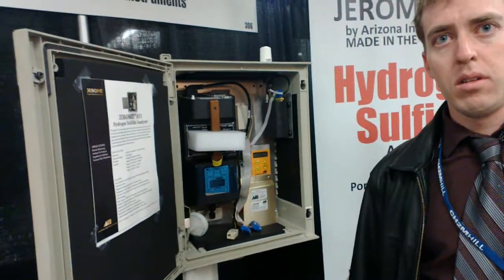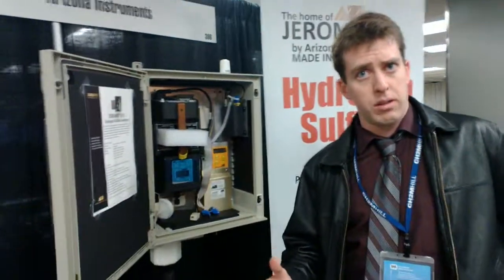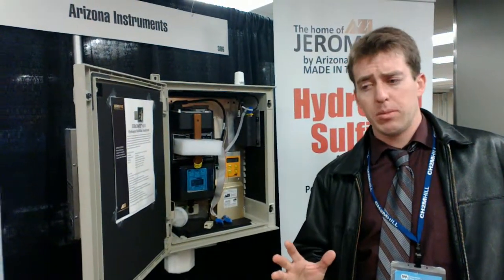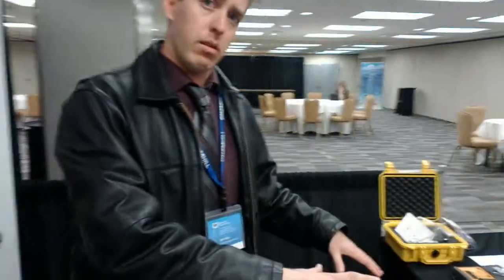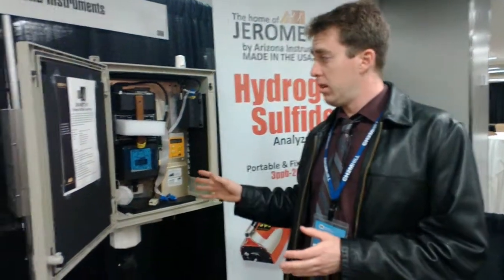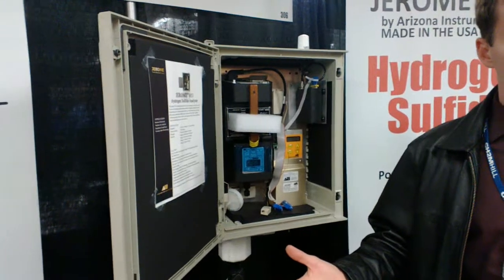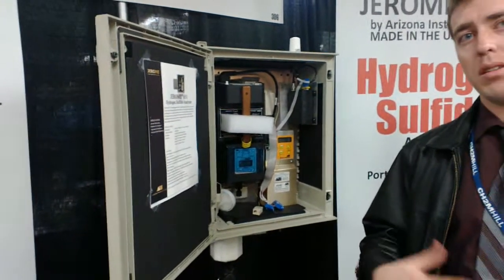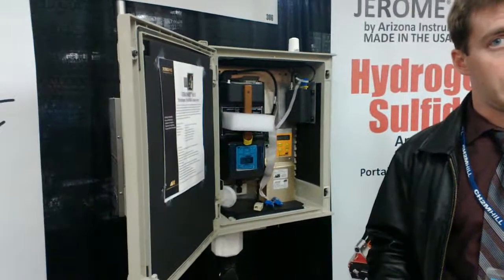Which kind of sensor does this equipment use? Well, these all use the gold film. And what you need to do is calibrate these instruments — at least with the handheld ones — once a year. You'll need to send them to us for that. It's a multi-level calibration. This stationary unit here, we need to see it at least once every three months based on use, because it's testing all the time. Some people are able to go six months or longer based on their sampling duration.